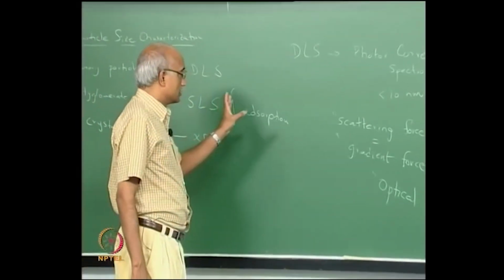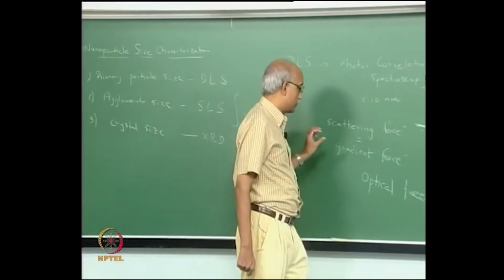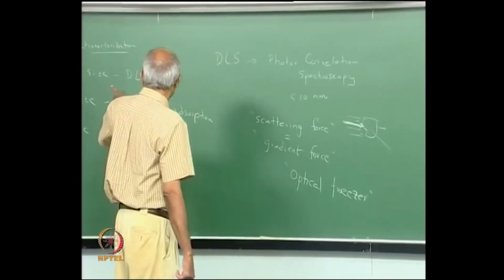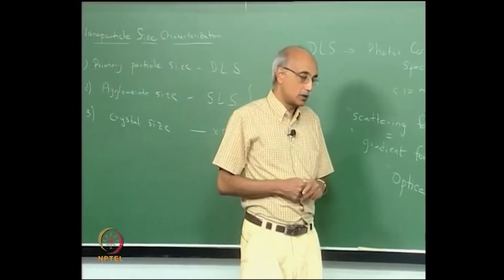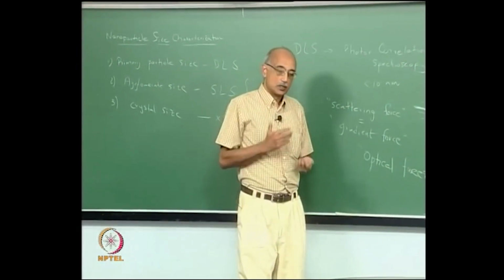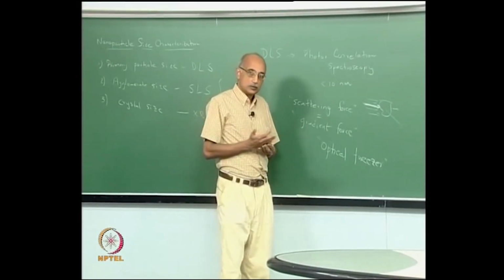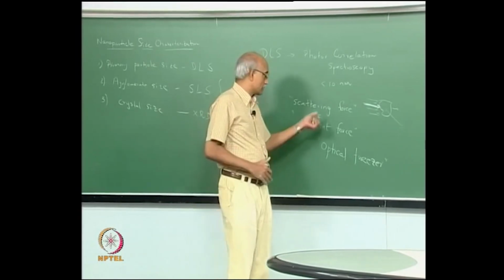So, when we are looking at agglomerates, the ability or the requirement that it must be held in place is very high. However, when we are looking at a dynamic light scattering device, which is actually what most of our scattering based instruments are based upon, the instrument automatically allows for a certain movement of the particle by diffusion. Now, the diffusion force is obviously going to be greater than either of these forces.